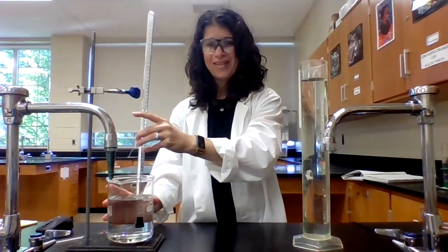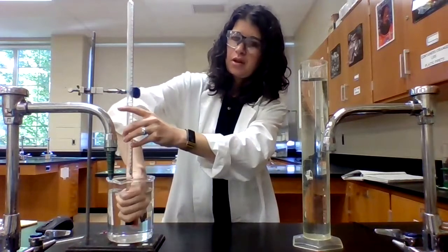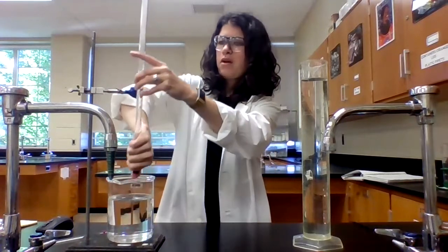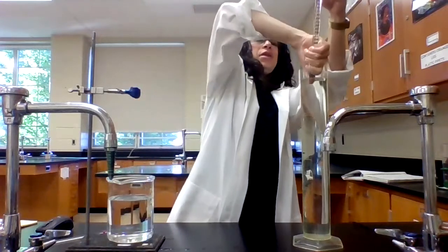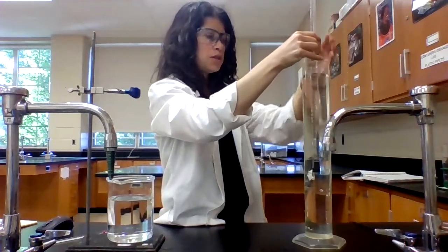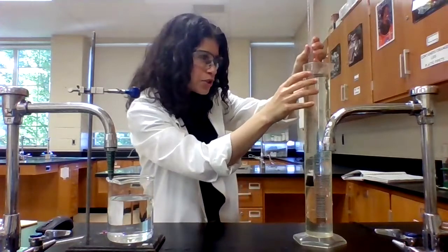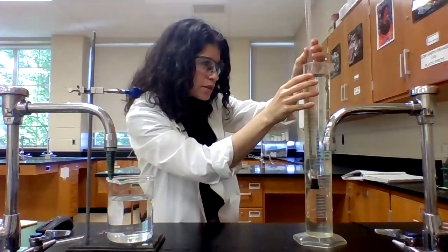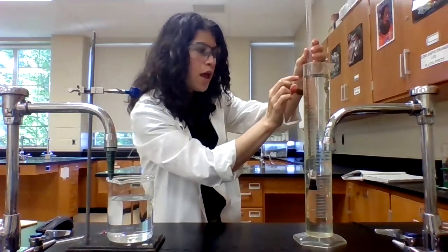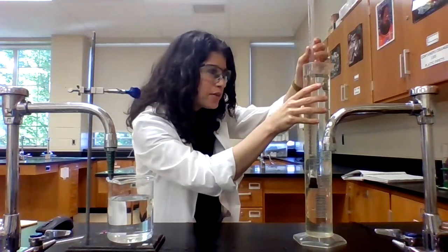Yes, there was hydrochloric acid, but it has been diluted in this beaker of water, so it's safe for me to put my hand in here. And I'm just going to cover up that hole there and transfer this inside here. And then what I want to do is get the levels to be the same height, and when they're the same height, that's when I'm going to record the volume of the hydrogen gas.